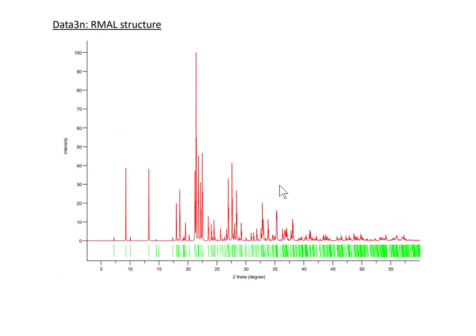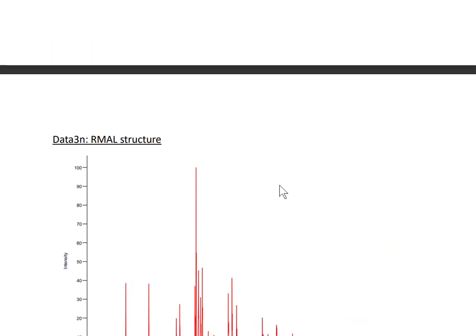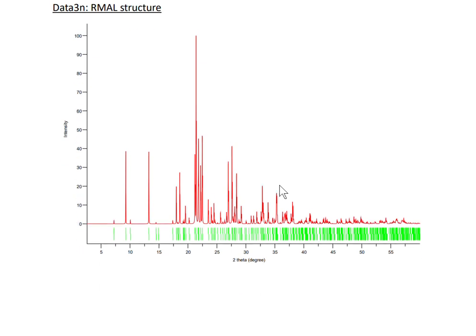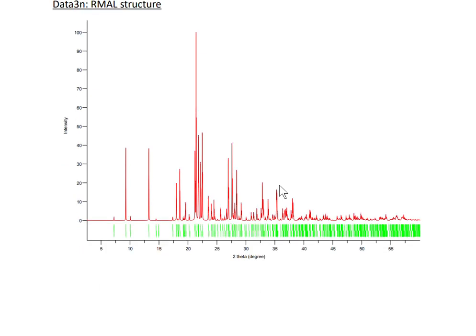So that was all for this assignment, and I want to mention that I really enjoyed doing this assignment, especially that OLEX2 part where we had to choose the atoms according to the electron densities. It was quite interesting. And yes, I learned a lot, not only through this assignment, but through the course as well, which was summed up in this assignment. So this was a good experience. Thank you.